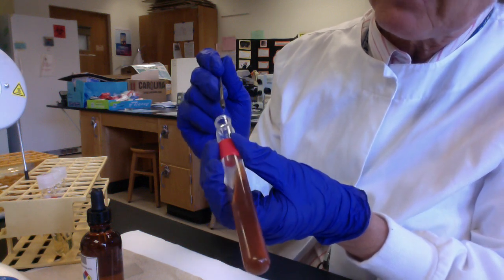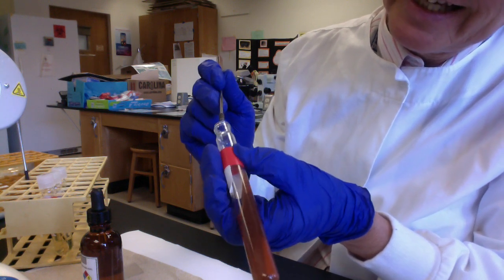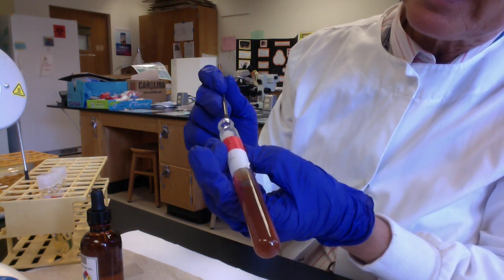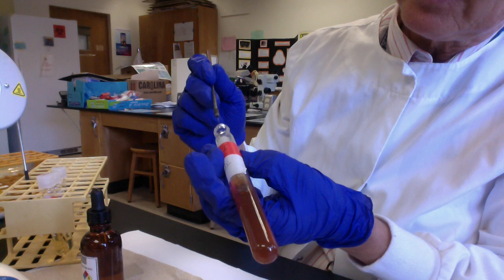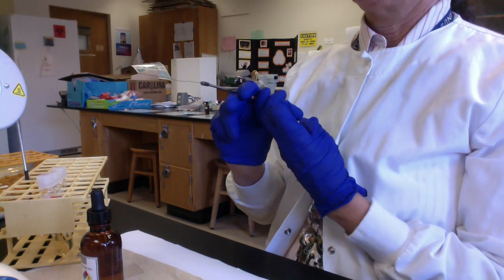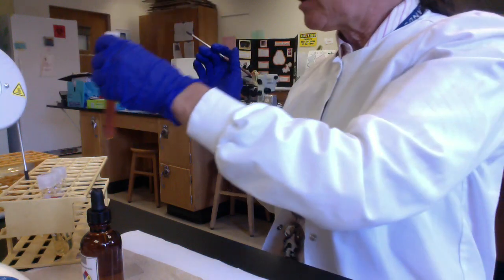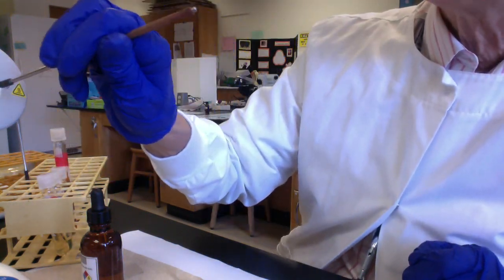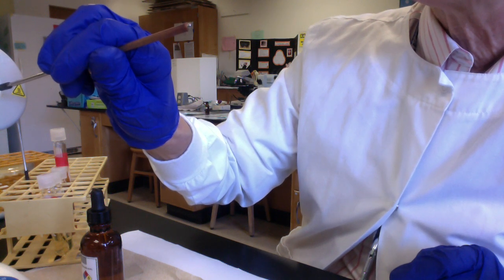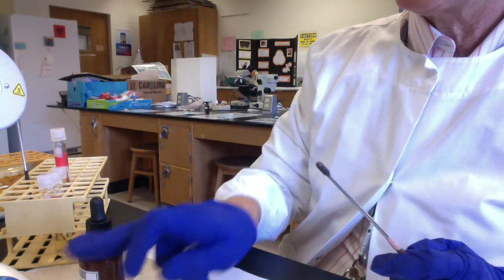And I withdraw, and then, folks, that's the stab, and then I'm going to withdraw, and if I can see here, can't see very well, I'm going to streak the surface of the slant so that my microbes are also growing aerobically. Okay, that was a little bit awkward. Sorry about that. Oh my goodness. Okay, and again, folks, loose caps, we're going to incubate for 48 hours, and then we'll have a follow-up video showing you the results of all of our plates, all of our tubes. So that'll be kind of a fun movie to make this weekend if all goes well.